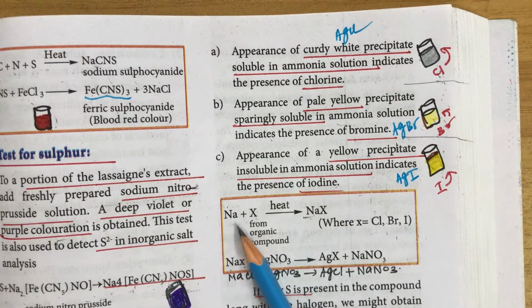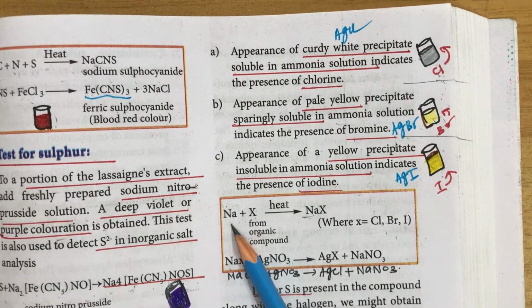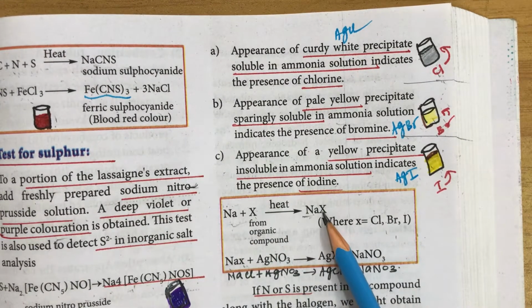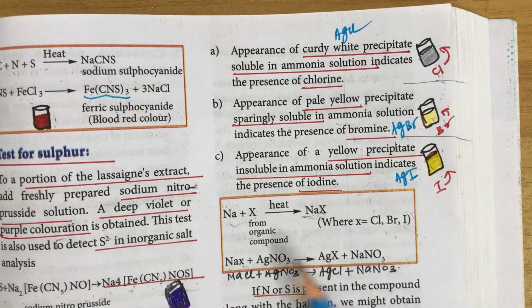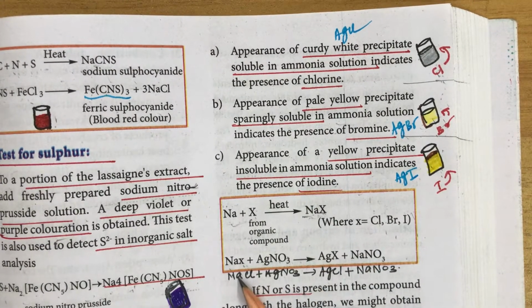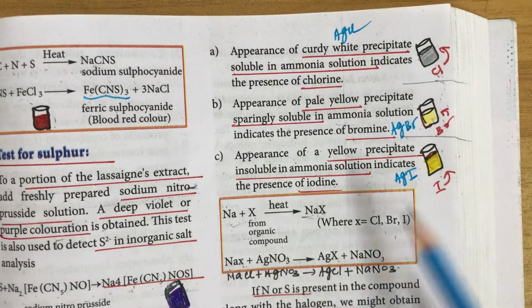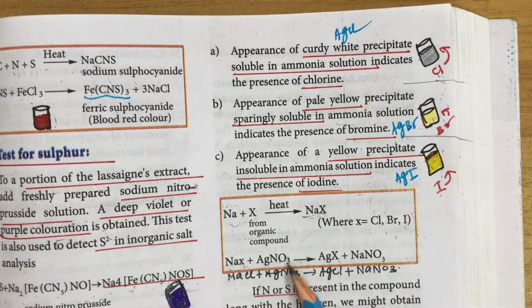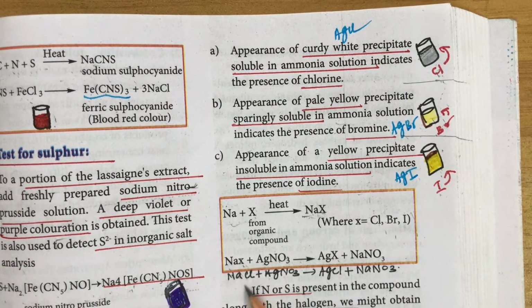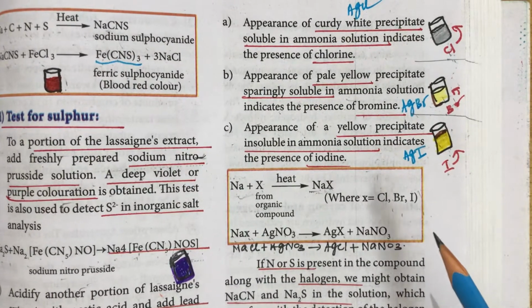The halogen present in an organic compound, during preparation of the Lassaigne's extract, combines with sodium to form sodium halide: sodium chloride, sodium bromide, sodium iodide. If you add silver nitrate to that, it forms the corresponding silver salt: silver chloride, silver bromide, silver iodide. That is NaCl plus AgNO3 forms AgCl plus sodium nitrate.